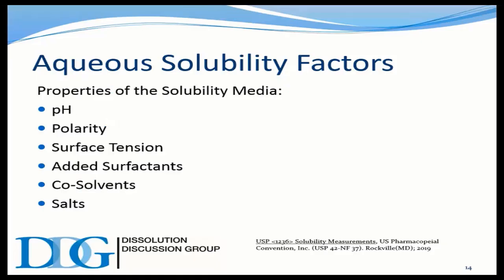Moving on to the media, there are quite a few things that affect the solubility that the media has for this drug, in terms of its pH, polarity, surface tension, and added surfactants. We are discussing poorly soluble drugs. The use of co-solvents is usually discouraged unless there are products that are quite difficult to put into solution with extra volume, even with the addition of surfactants. So solvents may be a last resort that may need to be used.